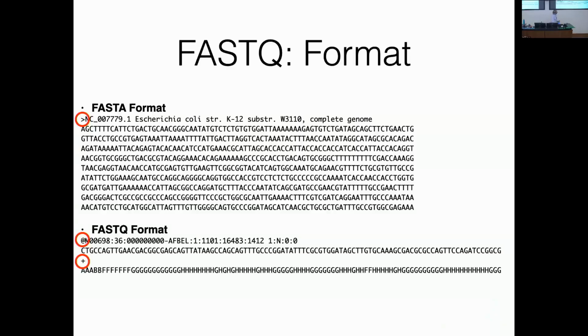And I will say, just as an aside, you don't need to remember this too much. You'll notice that in the FASTA file, it's about, I can't remember if this is 60 or 80 characters on a line, and then there's a new line, and it goes on the next line. That's just there for formatting. It's not really required, but it's pretty common to have those line lengths. It is pretty common for a FASTQ file for the line to be as long as the read length, right?